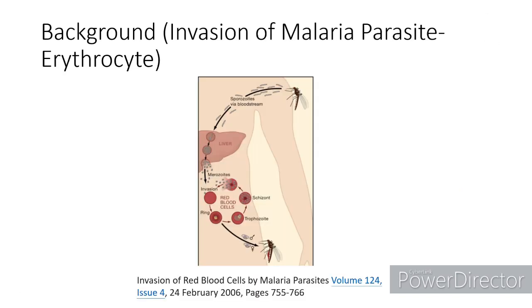This is the life cycle of the malaria parasite, and this article will focus here, on the invasion of the merozoites. By using optical tweezers, we can measure the force of the attachment of merozoites to the erythrocyte.